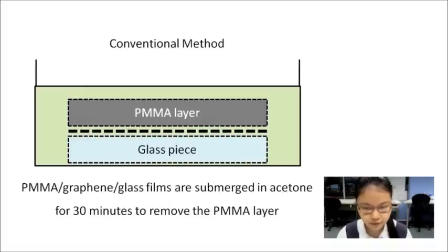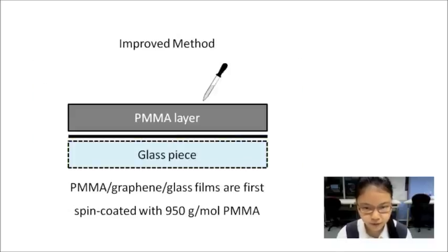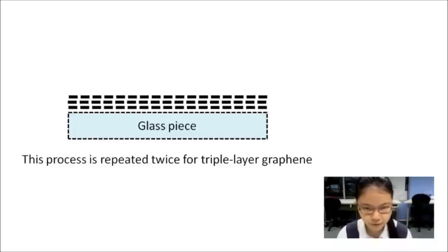For the conventional method, the PMMA graphene glass films are submerged in acetone for 30 minutes to remove the PMMA layer. For the improved method, the PMMA graphene glass films are spin coated with 950 gram per mole PMMA before they are submerged in acetone for 30 minutes. The graphene glass pieces are dried, and this process is repeated twice for triple-layer.